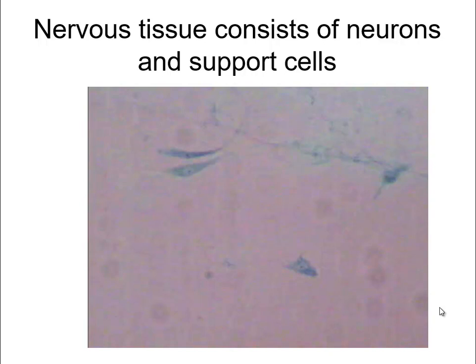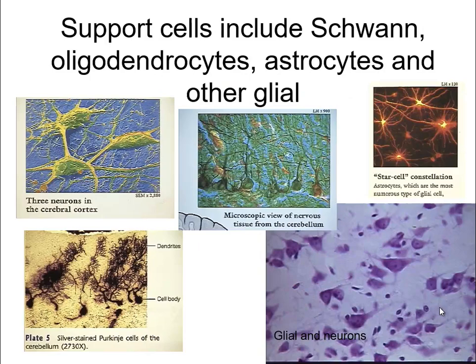Nerve cells are called neurons, and then you have support cells that nourish the neurons, take care of them, and interconnect them. You have cerebral cortex neurons, oligodendrocytes, and here's tissue from the cerebellum. Astrocytes are named because they look like stars. Then you have the Purkinje cells of the cerebellum and your glial and neuron cells. So you're going to have not so many neurons but a lot of support cells.